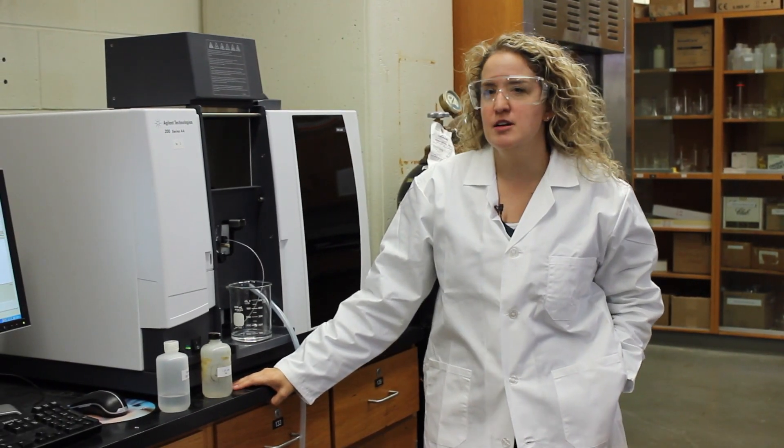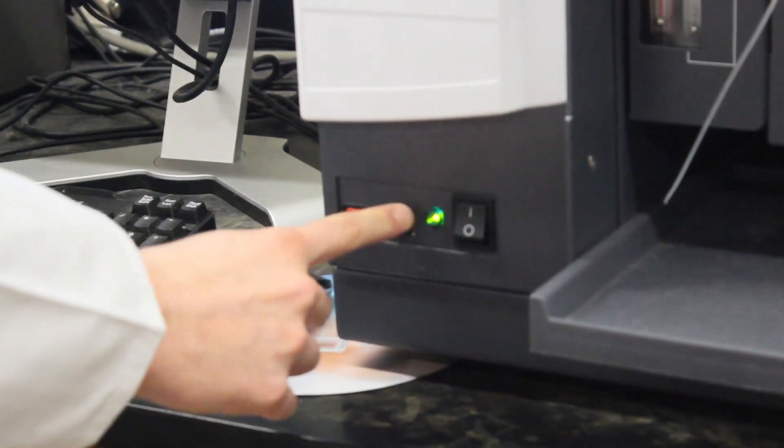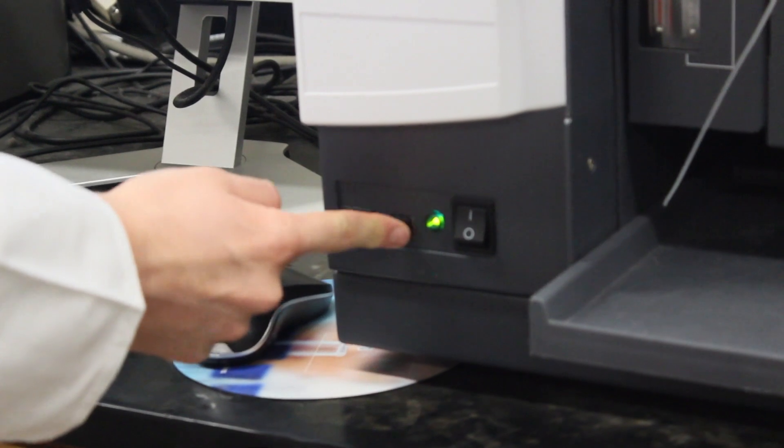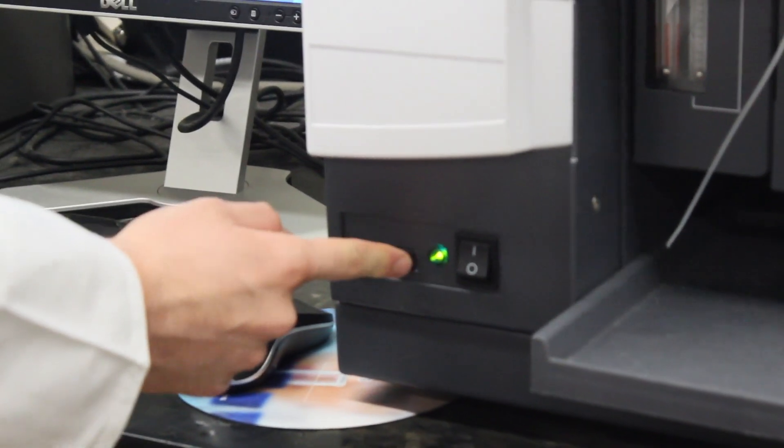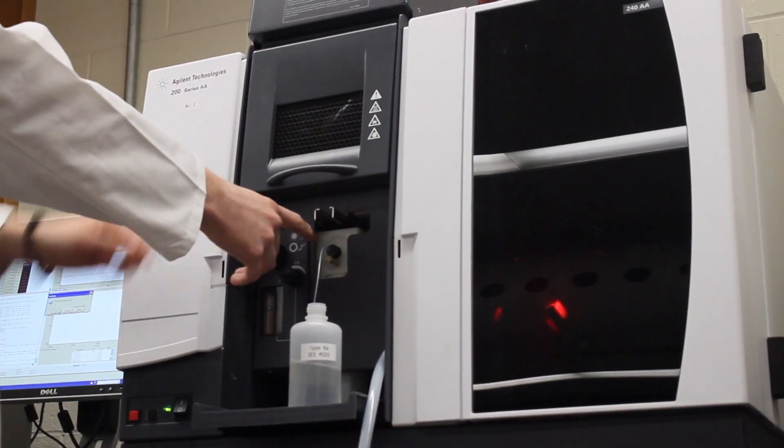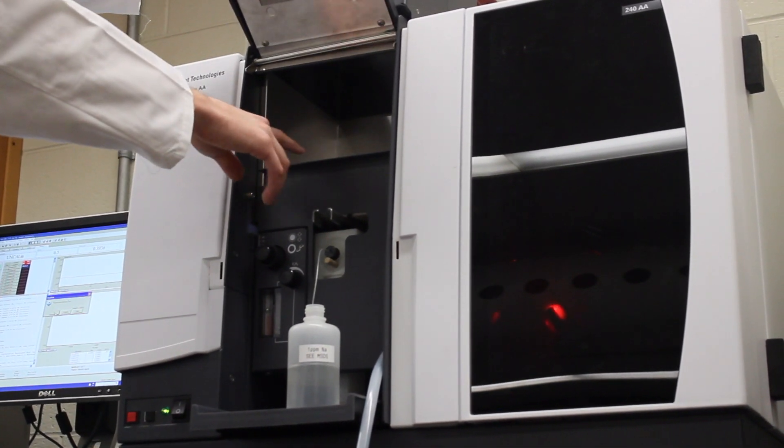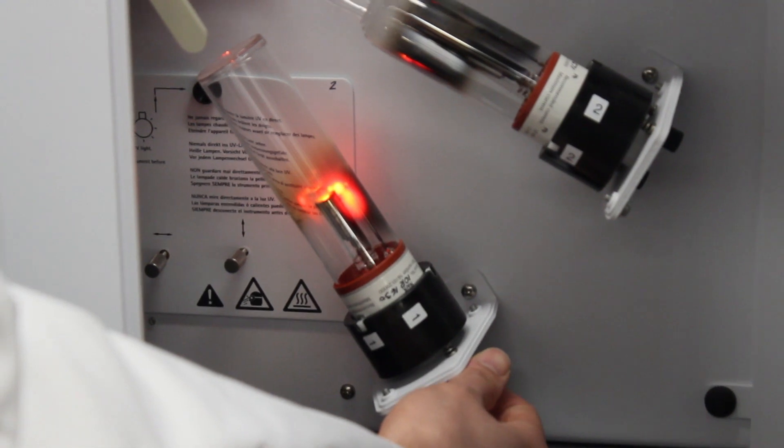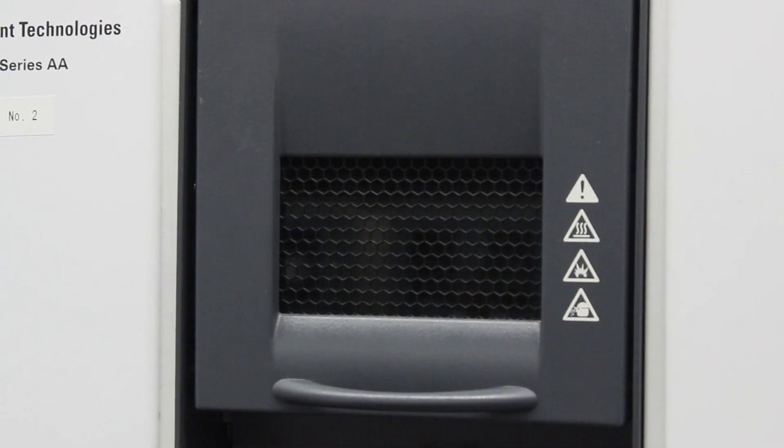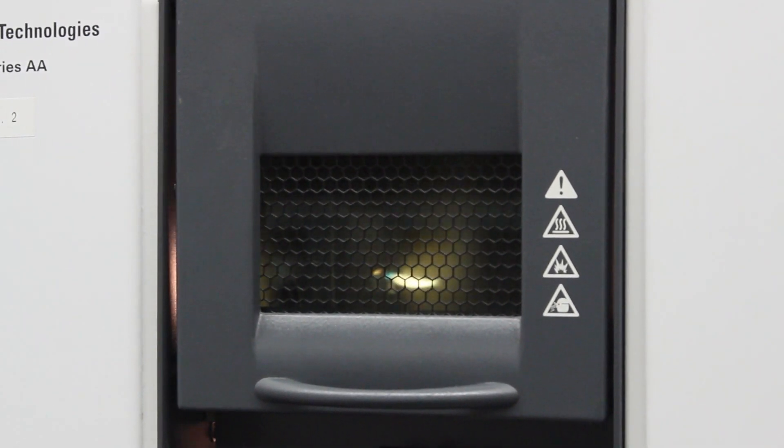This is an atomic absorption and emission spectrometer. It can analyze solutions of metals. Metals absorb and emit light, so this can test both. It looks at the concentration of metals in solution—the light that's absorbed or emitted is proportional to the concentration in that solution.